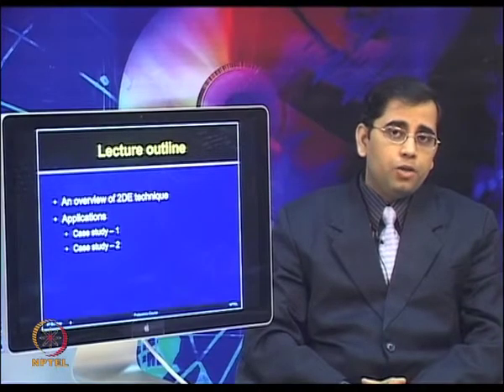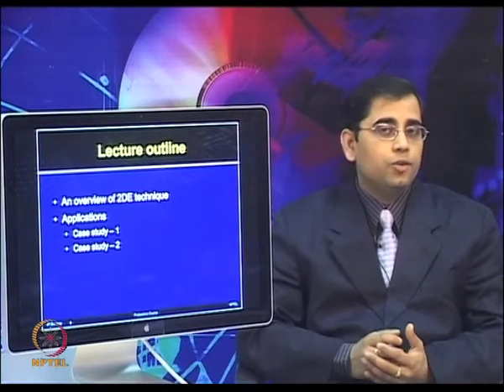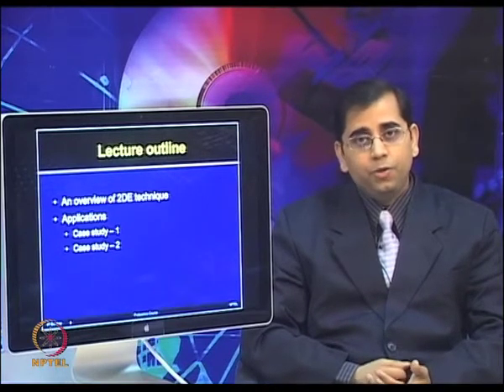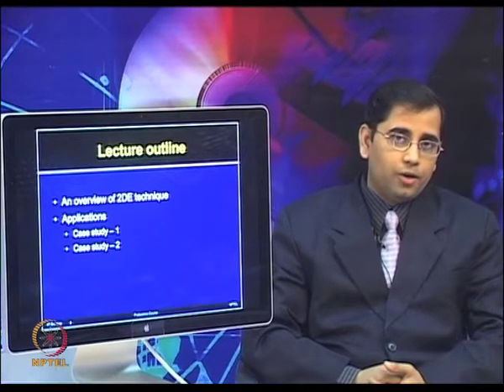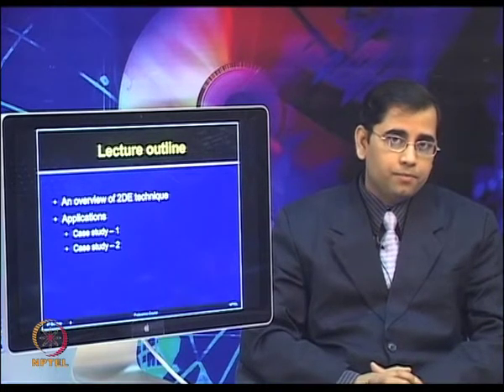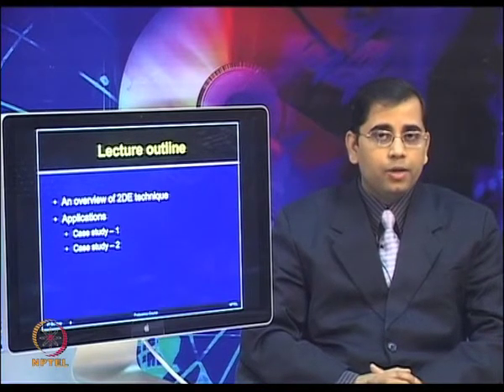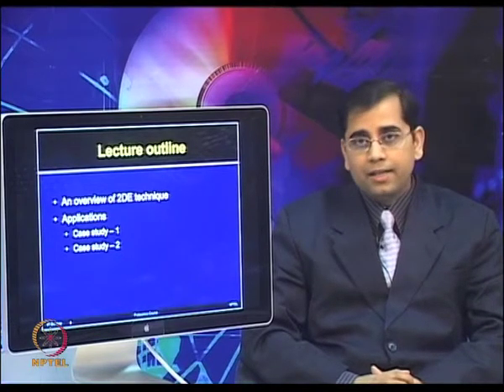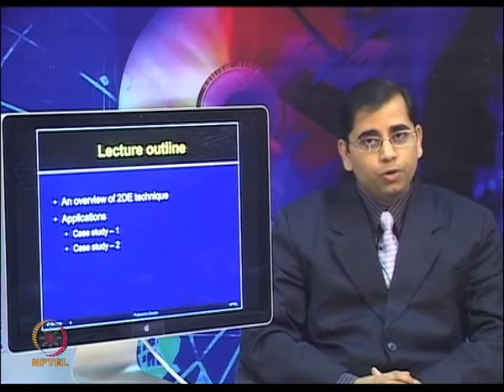Now, this two-dimensional electrophoresis technique is widely applicable in almost all areas of biological sciences. You name any application and you will see there are published reports on using two-dimensional electrophoresis or difference in gel electrophoresis, whether it is looking at different human diseases, drug responses, investigating plant stresses, or any drug treatment in bacterial species or other microbes.